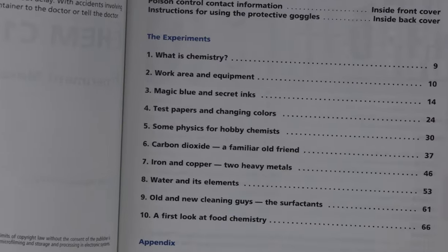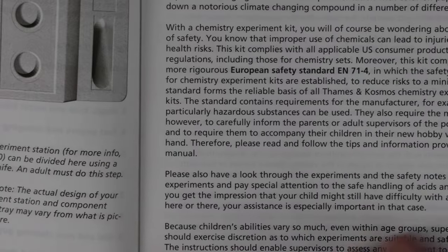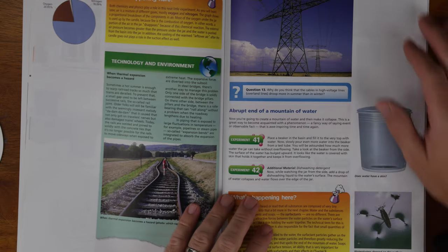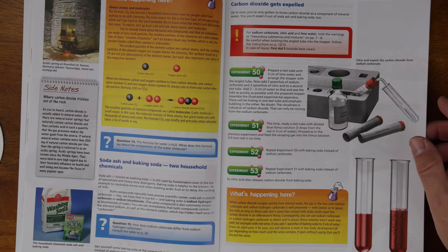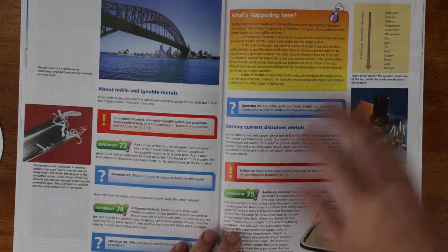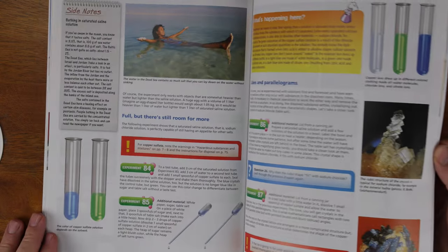You can see in the table of contents there are 10 sections. I think a better way to advertise this instead of '125 different experiments' would be to say '10 different chemistry topics,' because some of the experiments are quite repetitive and can be done within a few minutes. But if you break it down into topics and do one topic a week, this kit is going to last you about two and a half months — and I think that's a better way to look at it.